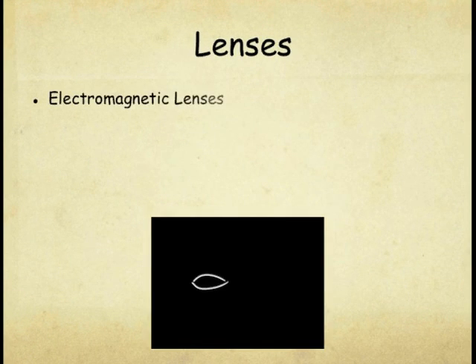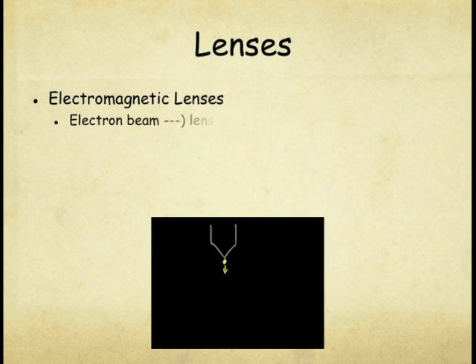Electromagnetic lenses, sometimes called electron lenses, are similar but different. First of all, the object in this case is not the sample you are investigating. In fact, you have to flip this mental picture upside down. In the optical lens, the light was emanating from the object, which happened to be your specimen of interest. In an electromagnetic lens, however, the object being imaged or demagnified by the lens is actually the source diameter of the electron beam as it exits the electron gun.